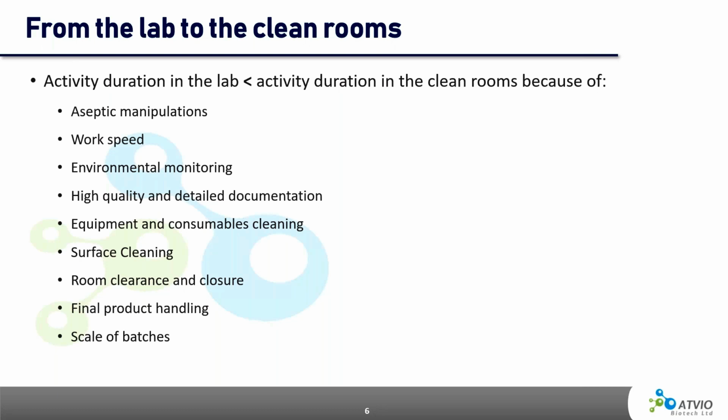Overall, we need to figure out ways to simplify the process as much as possible. For example, do we really need to change media every other day? What is an obvious manipulation in the lab will require additional steps in the clean room, and it's something that we need to take into consideration.